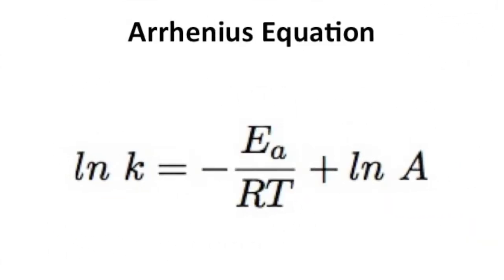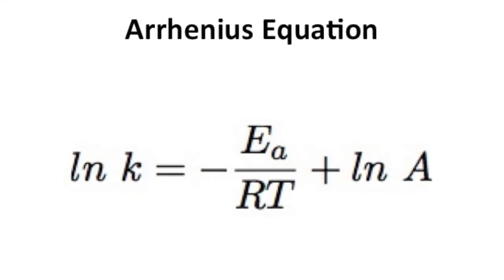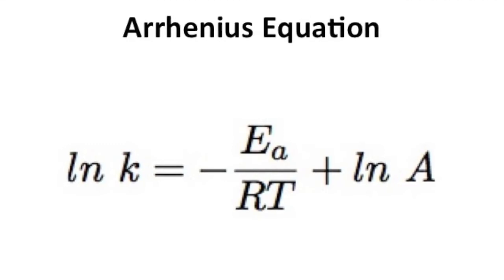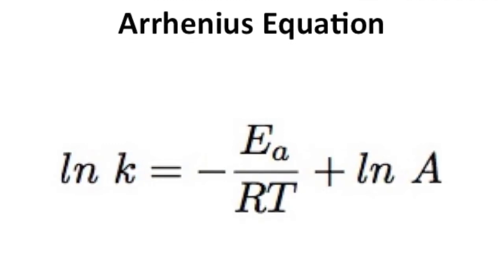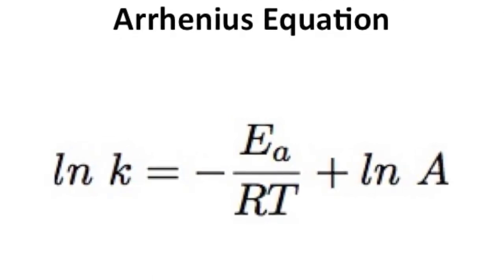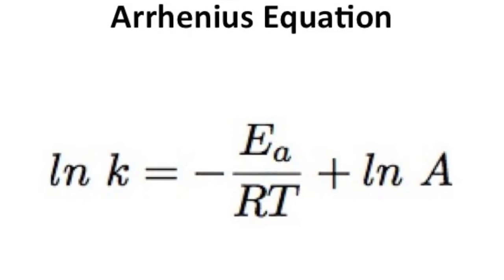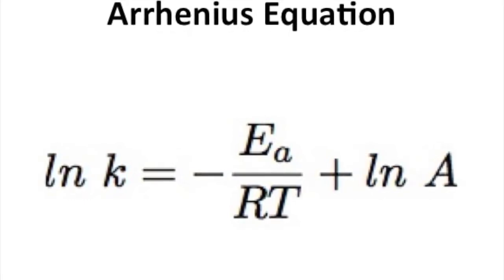The experimental batch reactor analysis of the rate constant at several temperatures can be used to design and size an appropriate CSTR. The effect of temperature on the rate constant can be determined using the Arrhenius expression. Rate data at the various temperatures can be used to determine the frequency factor and activation energy. The CSTR found in lab was then used to obtain experimental results and then compared to our predictive model.